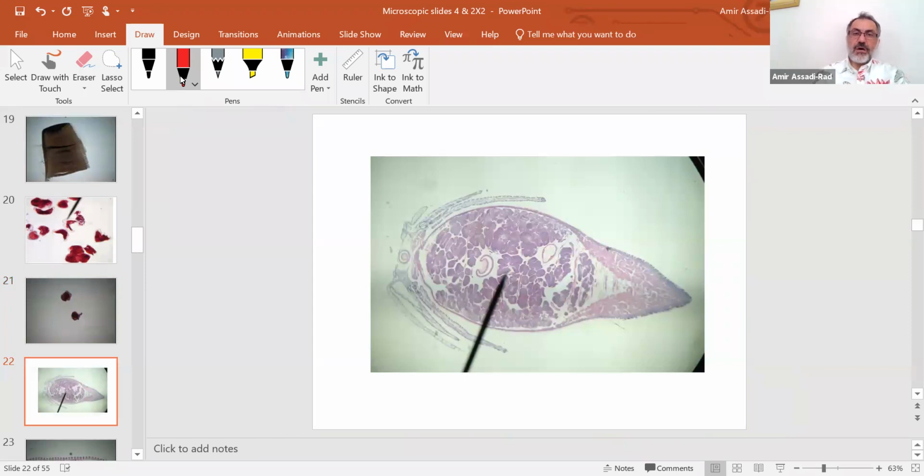This is the foot of a bivalve. So all of this is the foot. This is the mantle. These two are gills. You have two gills in here, and inside of the foot you have the gonad, intestine, and then up here this is the kidney. I draw a line. This is the heart and the intestine. Remember, the intestine passes through the heart in here.